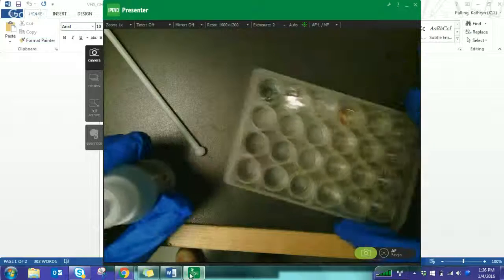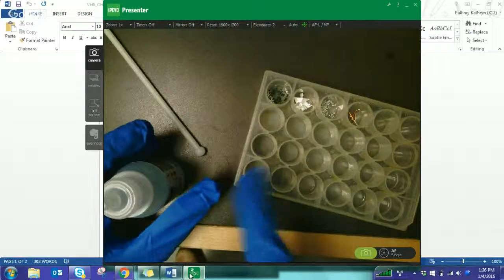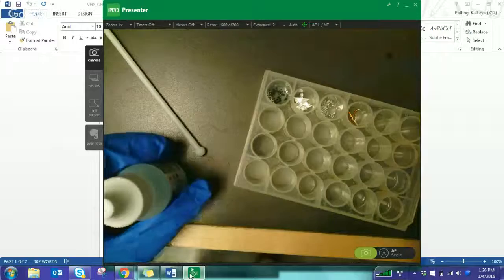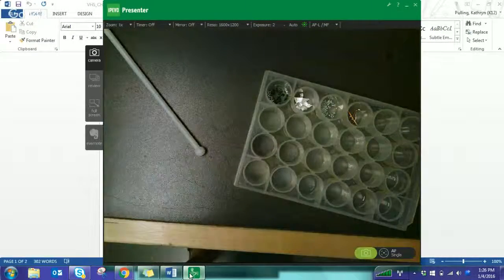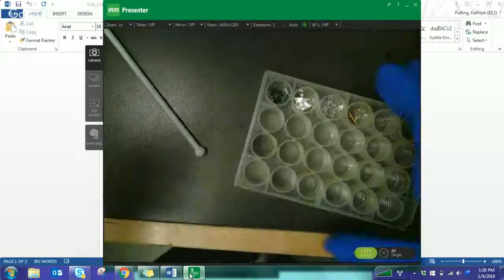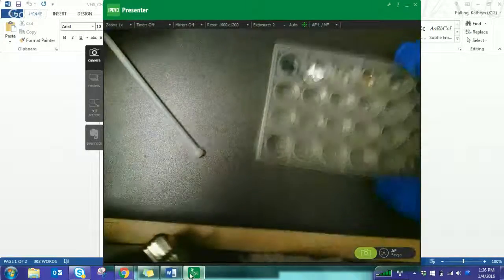If you look, the zinc floating on the top that hasn't really sunk in yet is still silver, but the stuff sunk down on the bottom turned black. All right, so we had a color change, which means chemical reaction. Okay, so go ahead and continue with the rest of those, so that you can see if you get any more reactions. I don't want to give them all away. So that's part 2.